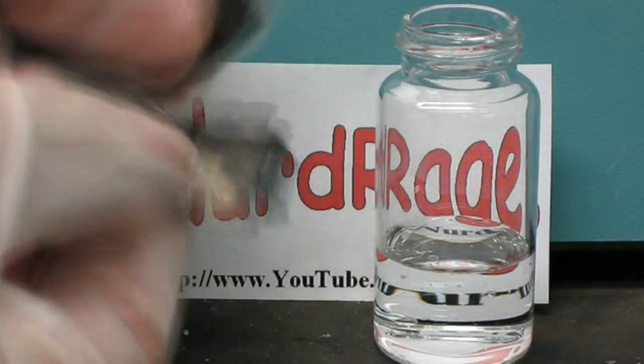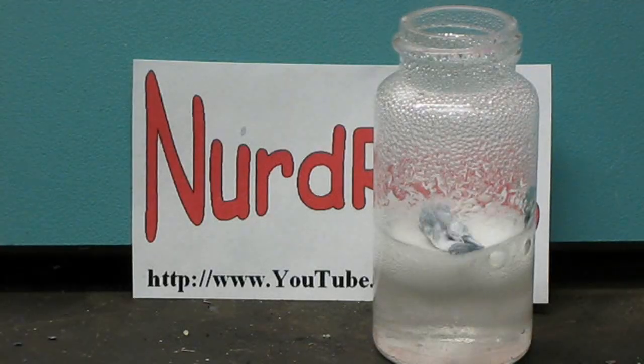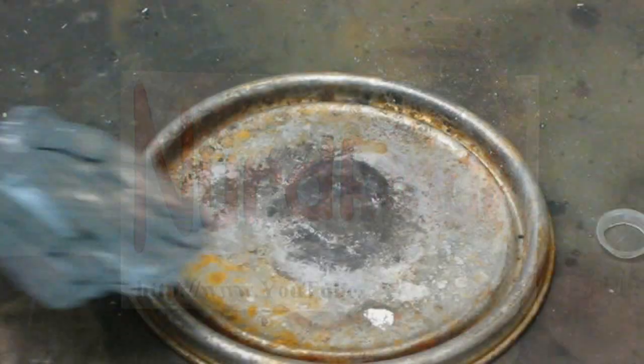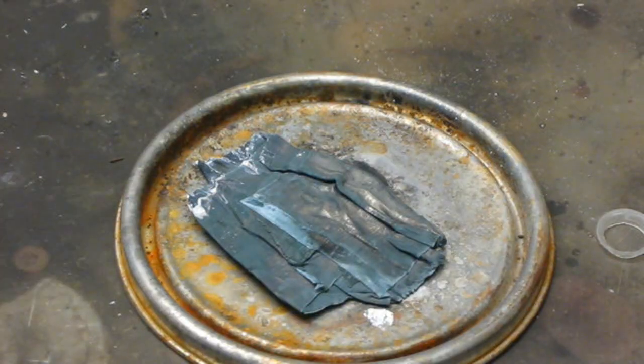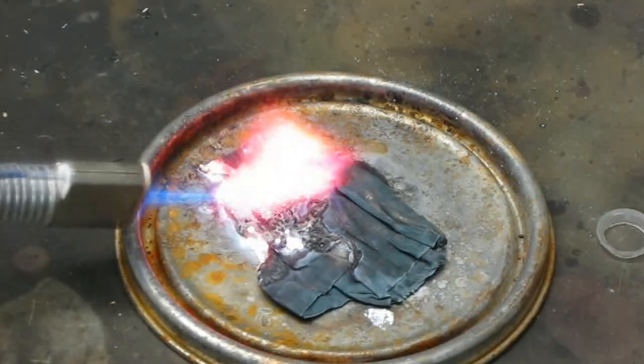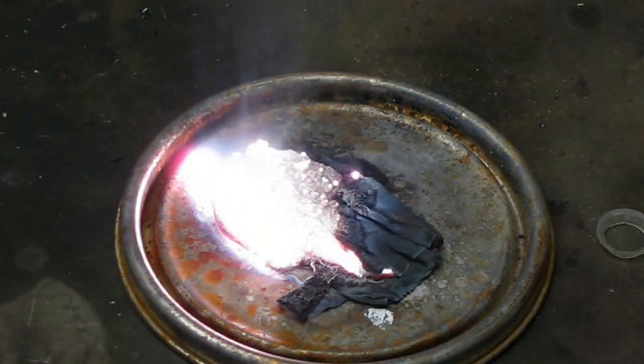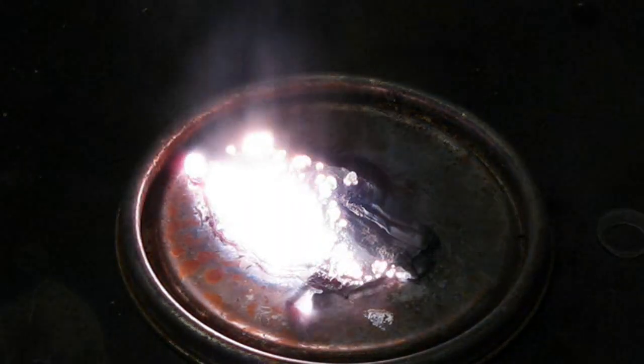Now one test for lithium is to just add a small piece to water. As you can see it's highly reactive and releases hydrogen gas. The second test is simply to burn it. You can see in just the few minutes I've had it, it's already severely tarnished due to its reaction with air. To burn it just set it on fire with a torch. The camera does not do this reaction justice — in real life it was so intense that I could not look directly at it. It was like looking into the sun. This little piece was so bright that it lit up the entire lab.